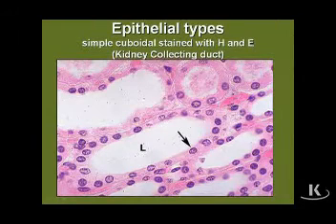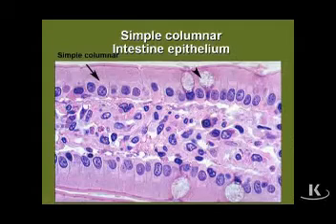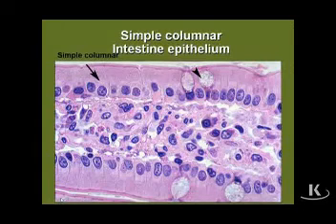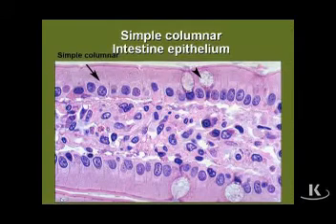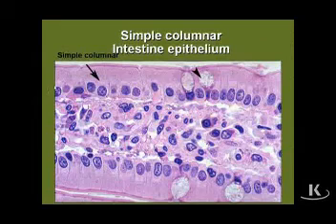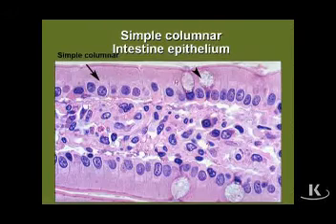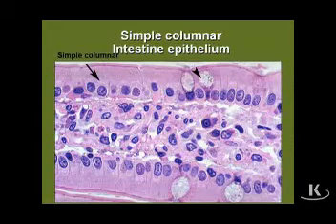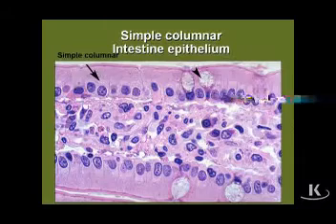This next example is a simple columnar epithelium, highly characteristic of the small and large intestine. Unlike the kidney's simple cuboidal epithelium, this epithelium has many different cell types, two of which are illustrated here. Much of the villus comprising the small intestine is lined by absorptive simple columnar epithelium with microvilli, or a brush border, shown at the arrow. At the arrowhead are examples of unicellular goblet mucus-secreting cells that also characterize this epithelium.